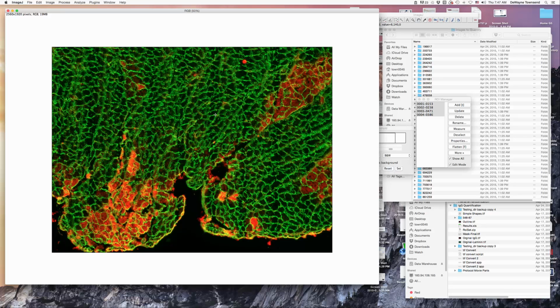One thing to keep in mind is that there's wide variability in the sizes and shapes, so it's a little bit challenging at times to make decisions, and it's something that will come with experience. As you look at more images, you'll get a better idea of what a myocyte looks like. You see these small little flecks that might be myocytes.